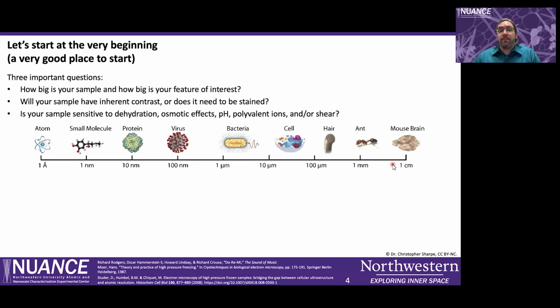So let's start right at the beginning, because that is the very best place to start, with three really important questions for picking the technique that will be best for you. The first question is, how big is your sample and how big is your feature of interest? That will drive a lot of deciding which technique will work best for your sample. It's not the definitive answer. The other two questions are important for guiding this a little bit more, but it is probably the biggest one.